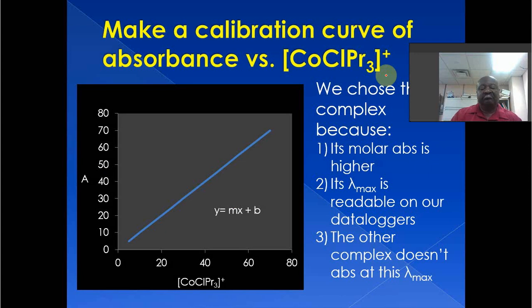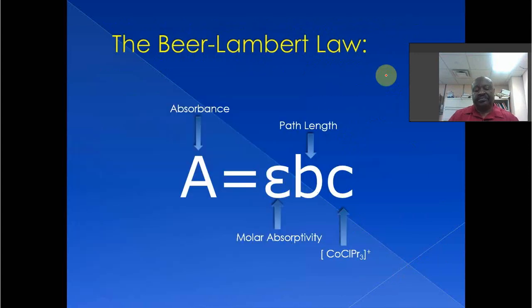There it is. It's 610 nanometers or whatever it is. All right, so it just means that with our calibration plot, when and if we measure the absorbance of an unknown solution, then we can figure out what this concentration is. Remember, these two here equal the slope in our calibration plot. But at the present time, we won't care about those. So if we measure the absorbance, we calculate the concentration from this equation. Concentration of what? Concentration of the tetrahedral one, the blue one.